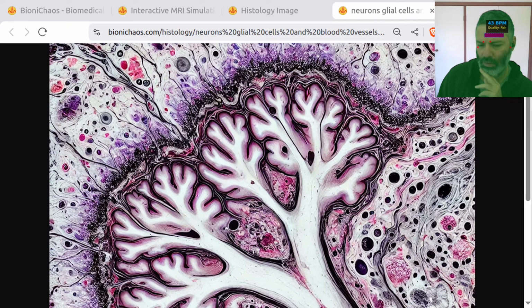Sure, cell counting detects and counts cells, tissue classification labels regions, morphological measurements quantify shape and size, density analysis measures how densely packed structures are, co-localization analysis checks spatial relationships, and feature extraction pulls measurable image attributes. Segmentation delineates distinct regions, and intensity profiling tracks pixel intensity variations. Each focuses on different analysis aspects.